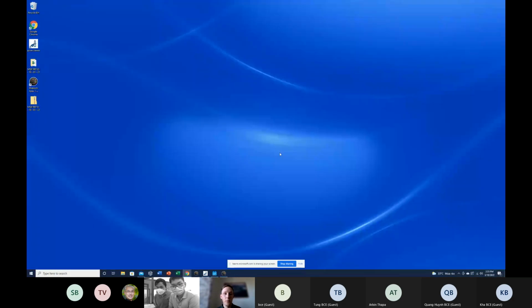And now for the next step, my plan is to give you a brief presentation about the IQOQ or the installation process, followed by a little bit of a product introduction. So for now, you can just sit down and I will share my screen and give you some presentations. I think it's going to take around 1 hour, so we don't need 3 hours today.